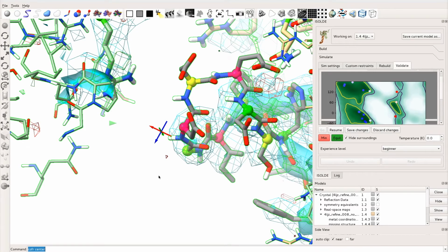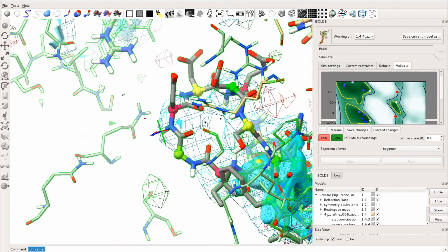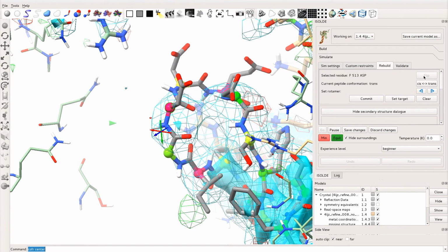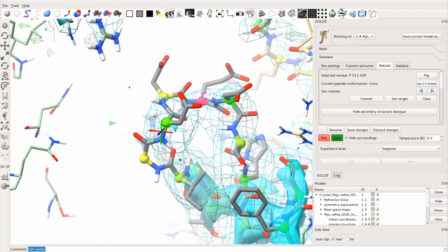As well as the examples I've shown, I've spent roughly 2 days working through the structure from end to end, fixing numerous smaller scale issues as I found them. At that stage, I find it best to avoid spending too much time on the most weakly resolved sections. It's far more productive to fix all the obvious problems in well-resolved regions first, then tackle the harder regions in the improved maps yielded by re-refinement.